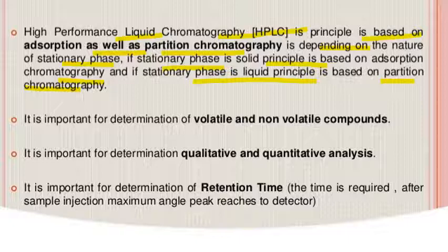It is important for the determination of volatile as well as non-volatile compounds. As we have seen in gas chromatography, we are very much restricted to the separation of volatile components. But in this HPLC, non-volatile compounds can also be separated out. It is very important for qualitative and quantitative analysis.